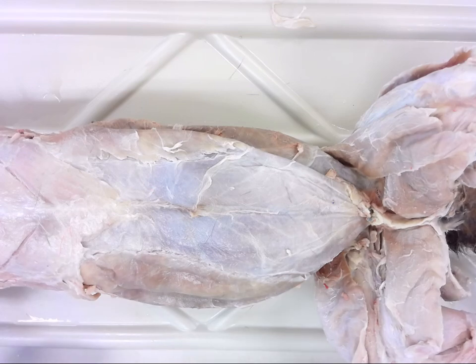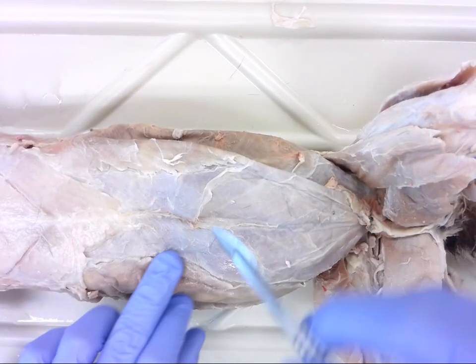This is for some students a more difficult procedure, not necessarily from the actual dissection, but actually getting into the abdominal contents. It can be somewhat disturbing. So hopefully this video helps you to know what you've got coming and what you're going to come across when we get through there. So what you're going to do is you're going to find the linea alba.